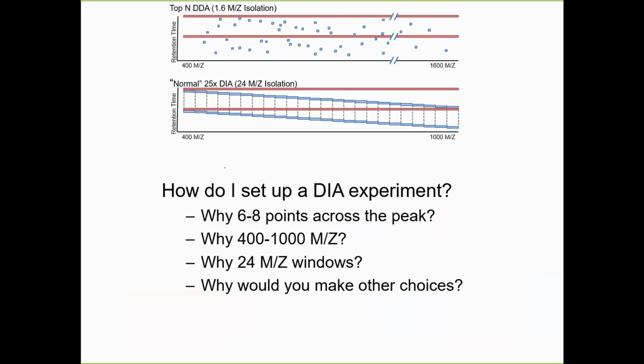So to recap on all of the stuff that I've been talking about, we've compared DIA to DDA approaches, where in DDA, you typically let the instrument decide what peptides you want to sample, and then measure different peptides at every single duty cycle. We can contrast that to typical normal DIA, where you have much wider precursor isolation windows, yet at the same time you can still measure the same, or a reasonable, precursor isolation range.